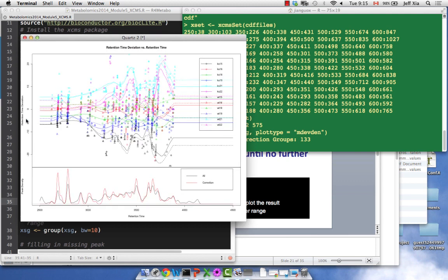For example, if we choose zero as the reference, some samples shifted positive, basically deviating more. Sometimes some samples will be just faster. So sometimes running slow, sometimes faster. Each sample is plotted differently.